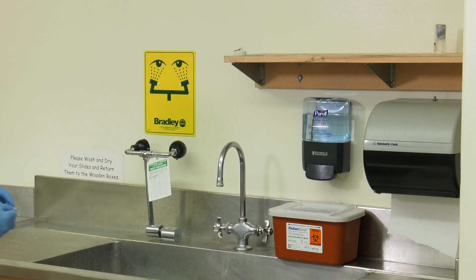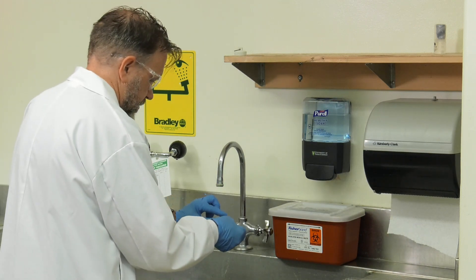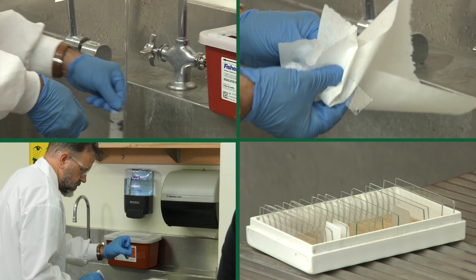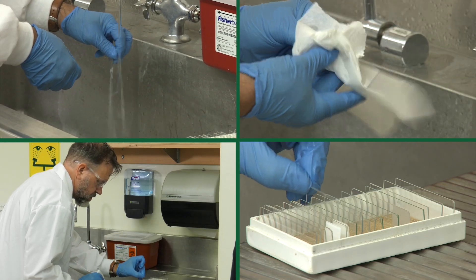Once finished with your preparation, take your slide to the sink. Carefully remove the coverslip and discard it in the provided sharps disposal. Rinse and dry your slide and return it to the slide box.